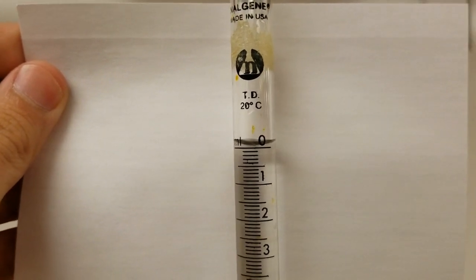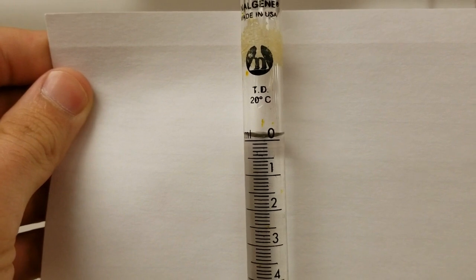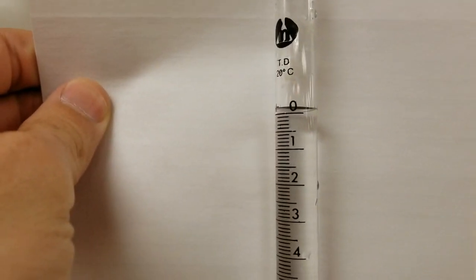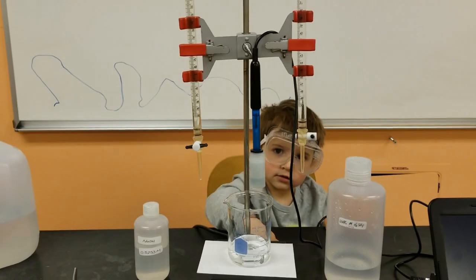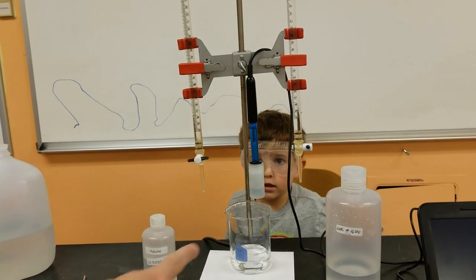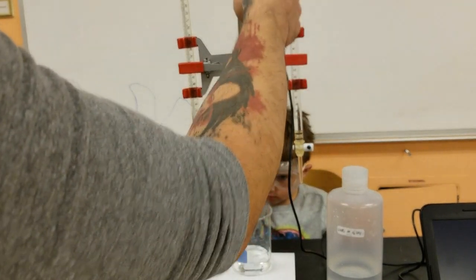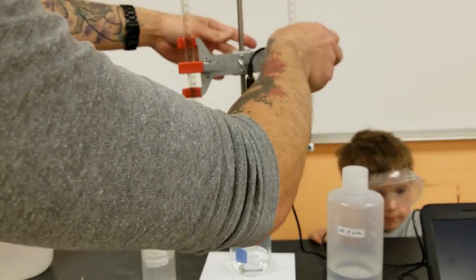So this is the base burette. You can see the meniscus is right on the 0 line, the bottom of the meniscus. This is the acid burette, also right at the 0 line. I've put in some water into the beaker to start off, and I'm going to put between 10 and 12 milliliters of the sulfuric acid.